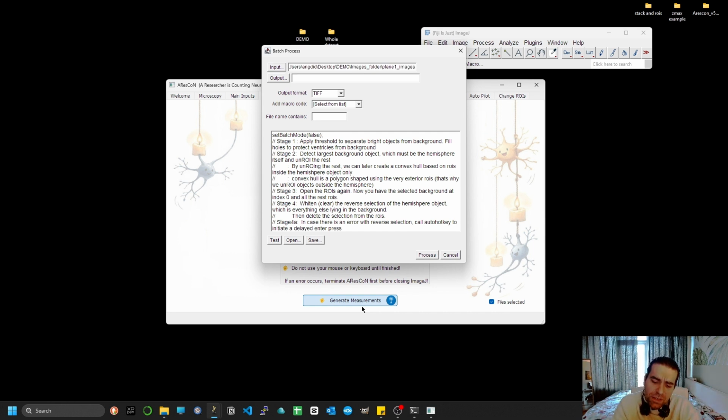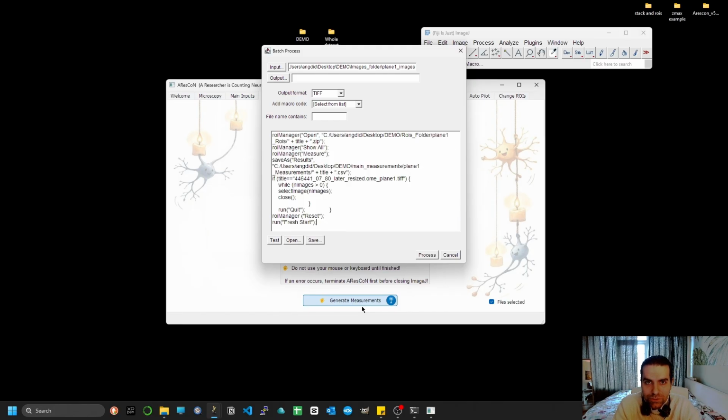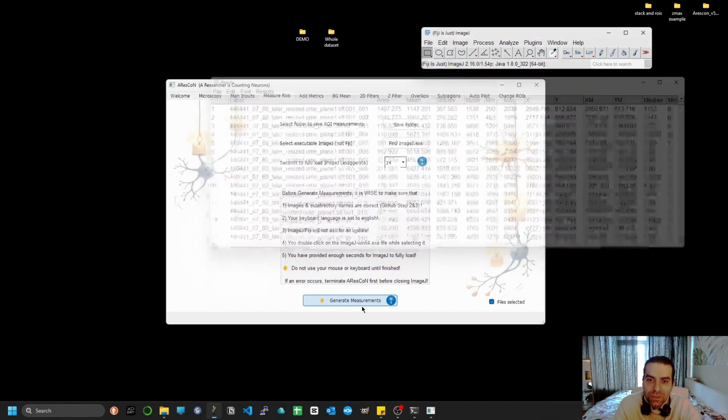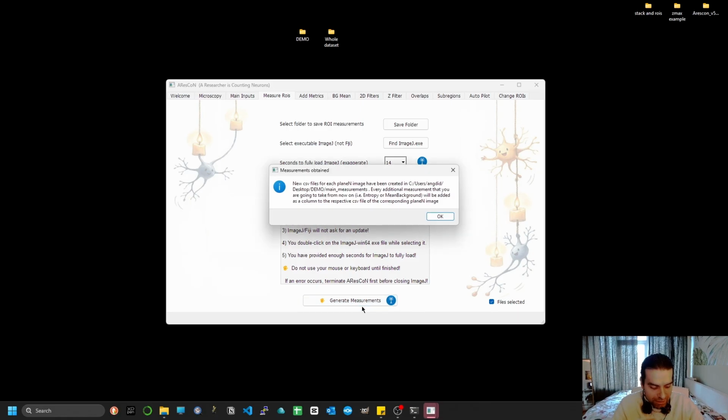What I want to say by this is that please refrain from setting your computer to sleep modes, because if you do so, probably Arescon won't work properly. So you shouldn't have a sleep mode, and how you can adjust it actually is that if you press Windows and L, not L, sorry, I just locked my screen.